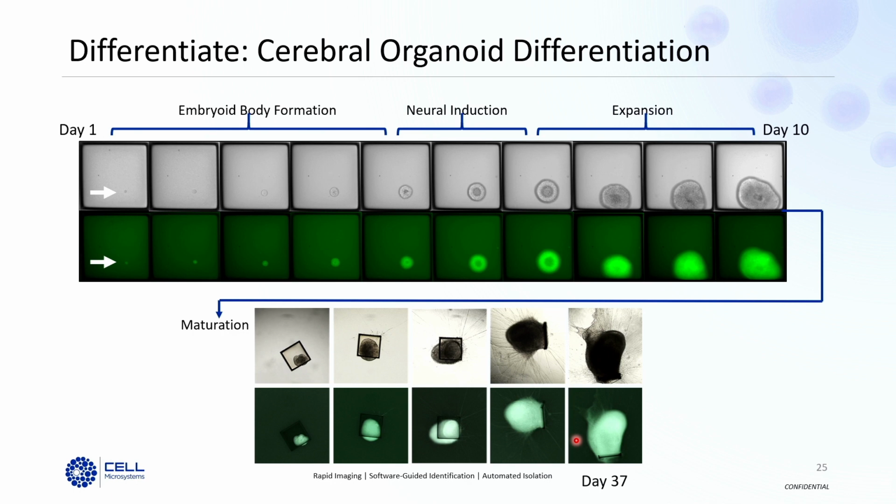As you're passaging the cells, trypsinizing them, or just moving them as suspension cells, the raft will eventually just get aspirated and be removed. And then, I'm sorry, can you repeat the question about the quantification? Quantification of ghost wells for cell line development with the suspension cells? Like how often do cells accidentally disappear, which means they probably moved into another raft by accident somehow? You're talking about on the array? Yes, on the array.